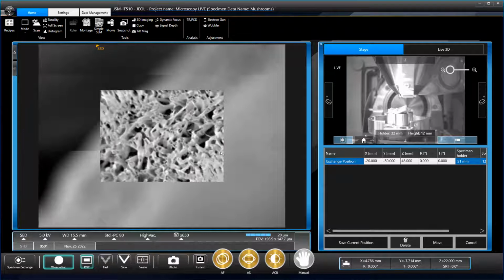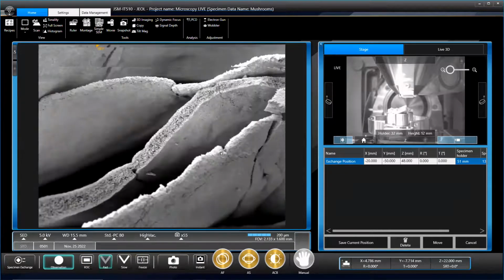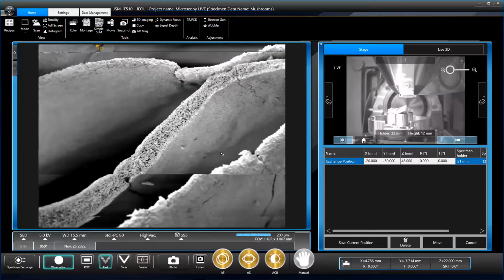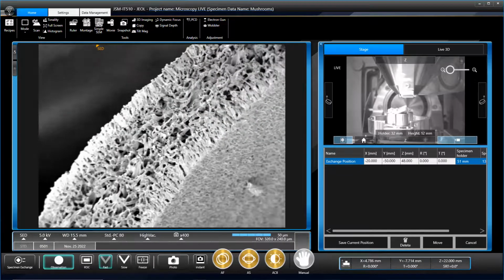That does look different. It does, doesn't it? Yeah. Like still tubes, but a bit more, I don't think, tangled. Are we looking at gills here, or are we looking at a different bit? I think this one is almost entirely gills. It's like the inner surface. Oh, yeah. It's the inside of it. I did try to get the rest of the mushroom, but then it fell off. Yeah, it looks like it's got lots of fun textural differences.